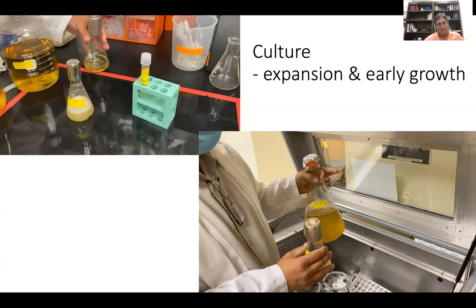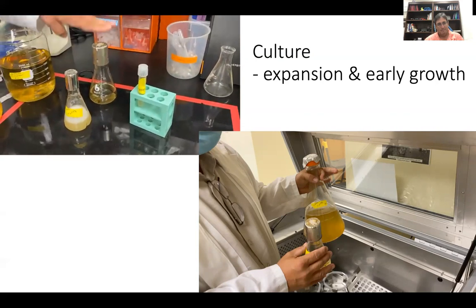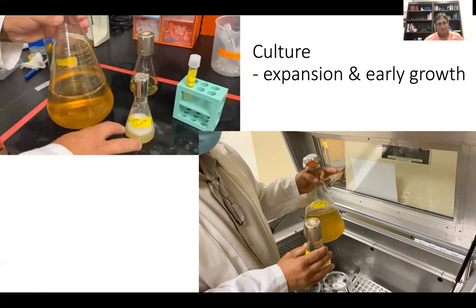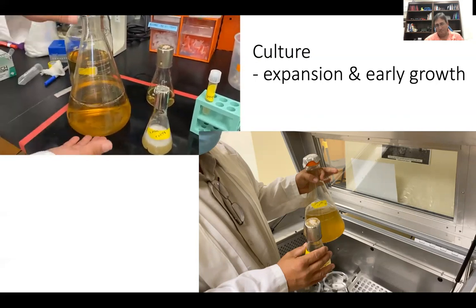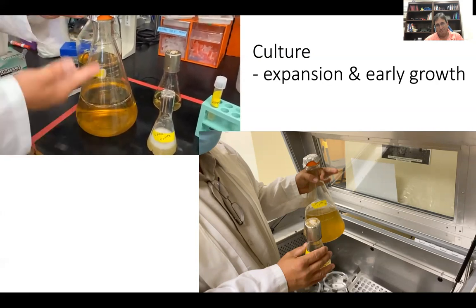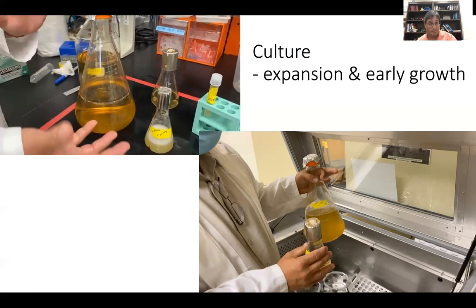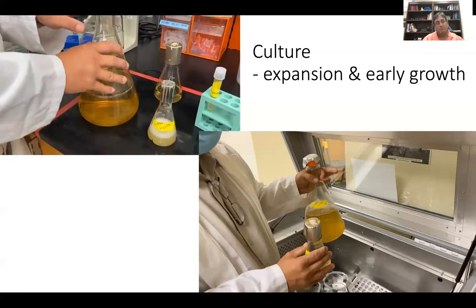We're going to do this in 2 batches. We're going to transfer 1 ml of this into 100 ml of fresh culture, again containing kanamycin, and we're going to take the 20 ml that we started and put it into 1.5 liters. Now, here, this is pushing the limit. We really should only have about 1 liter in this, but we're going to push it for today. If we were doing the exact best culture, we know this will grow pretty well in these conditions. We should really split this into 2 larger vessels.